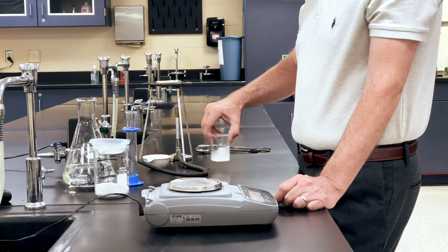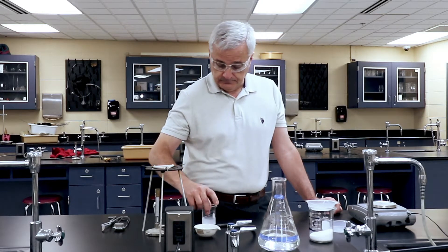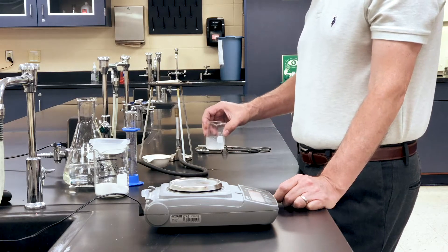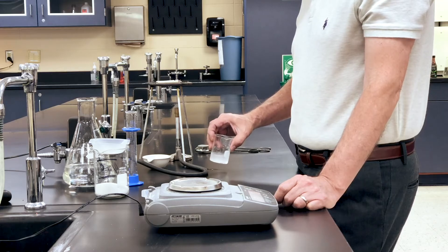I spilled some. That's why I'm wearing goggles — because if this weren't salt water, that could have been a bad thing. How do you spill water? It's very early.